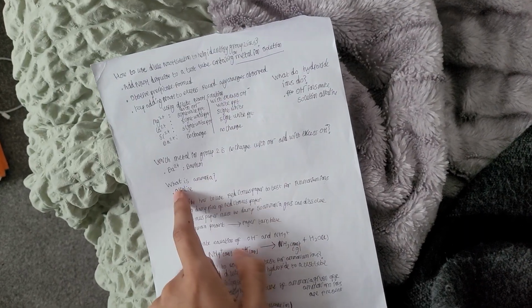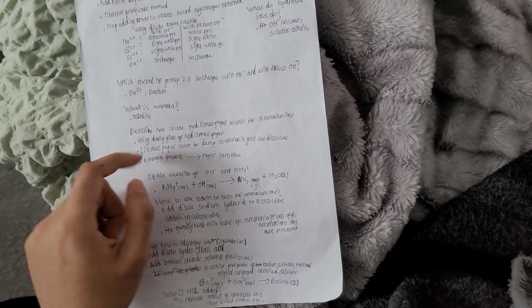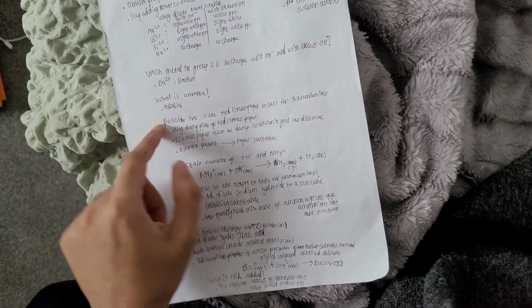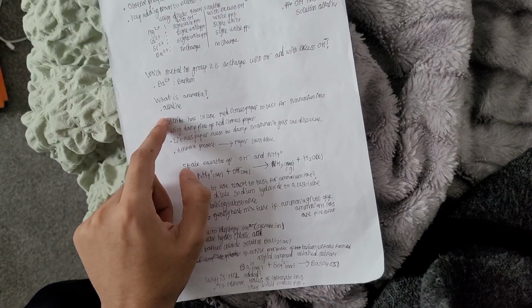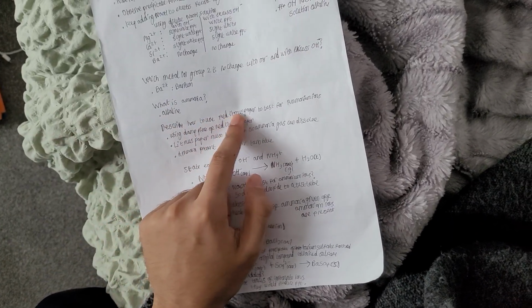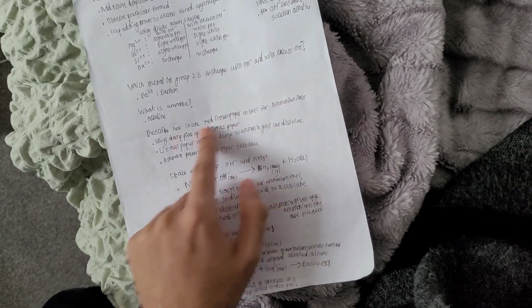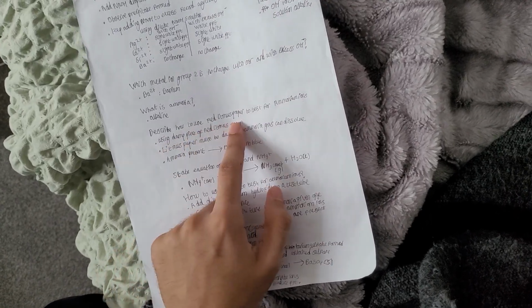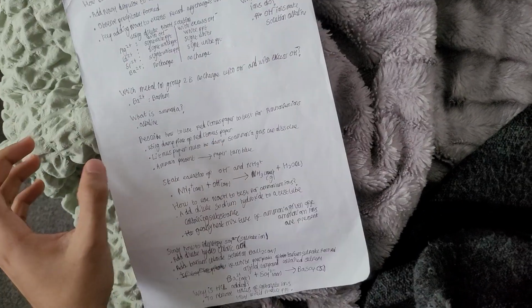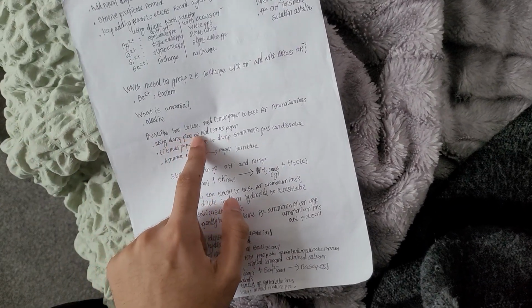What is ammonia? Alkaline. Ammonia is alkaline, and that's why we're going to use it now, just so you know that it's alkaline. So, describe how to use red litmus paper to test for ammonium ions. Well, you want to use a damp piece of red litmus paper. The litmus paper must be damp. Why?